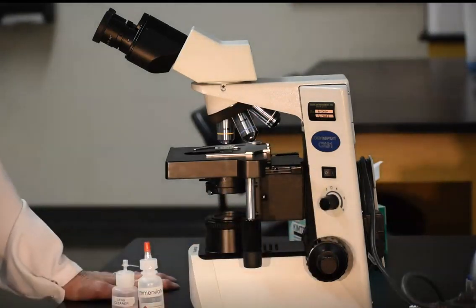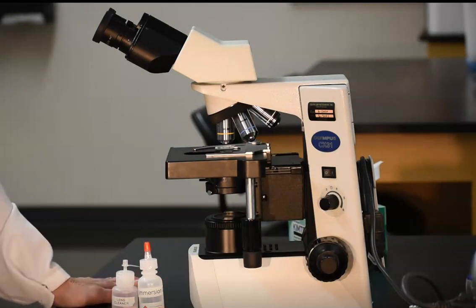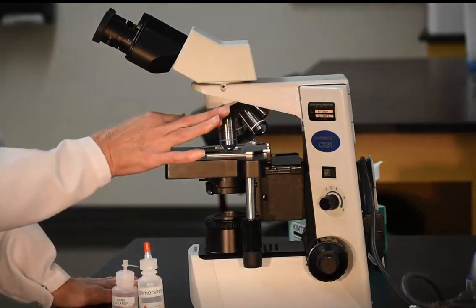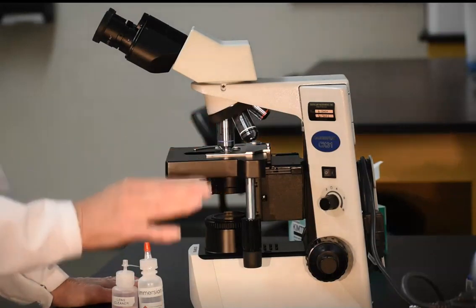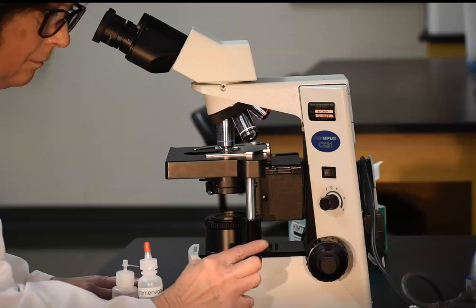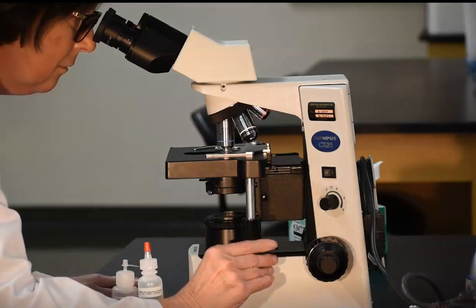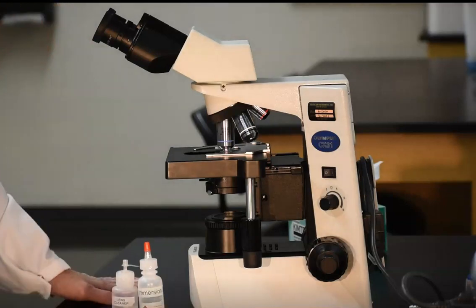Once you have obtained a clear image with the 10x lens, move the 40x objective or the next power into place. Again, adjust with the fine focus. Center your object in the field of view before you switch objectives, so it will not be lost as you move up in magnification and the field of view shrinks in size.